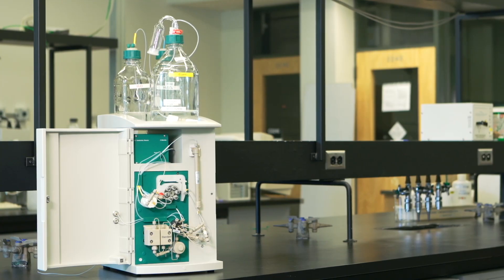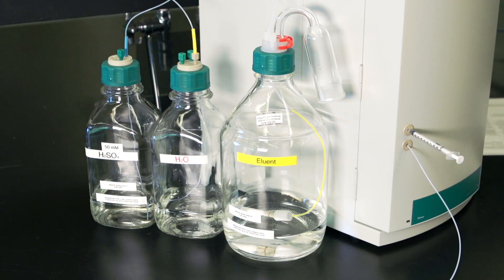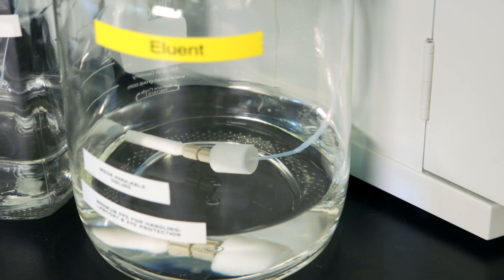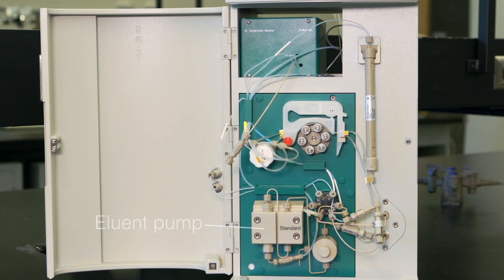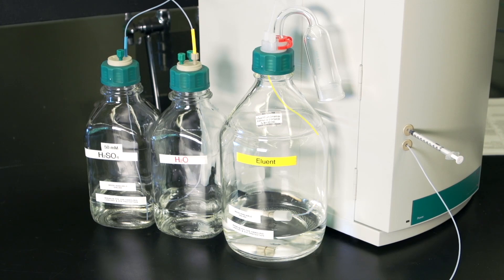We'll first start off with the mobile phase, otherwise known as the eluent. The eluent we use is a carbonate-bicarbonate buffer. It's carried throughout the instrument using a pump. A carbonate-bicarbonate buffer is used because it gives pH control and the total ionic strength can be easily modified.